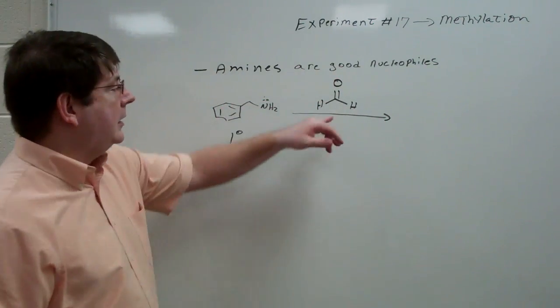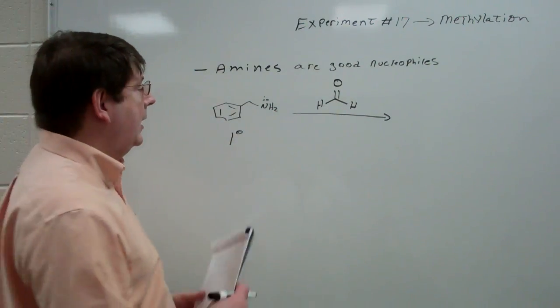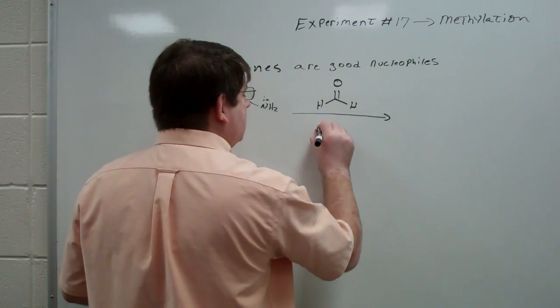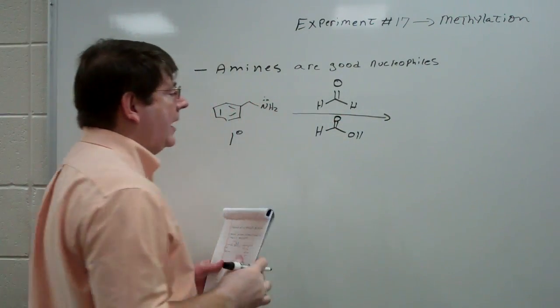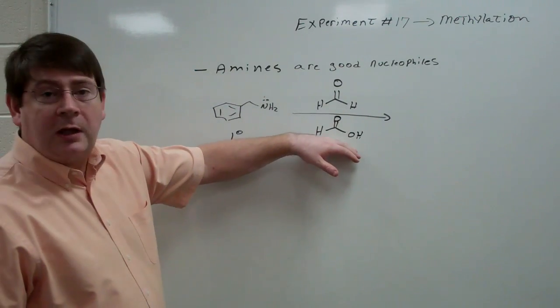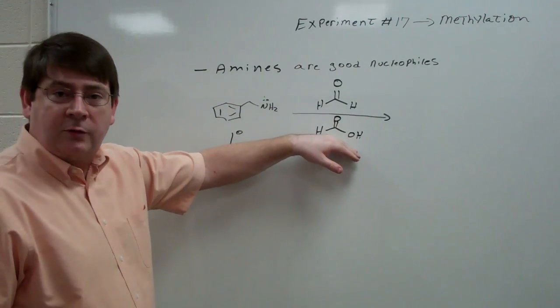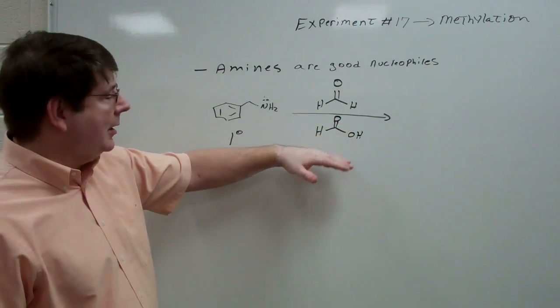This is the aldehyde that's used in biology to preserve specimens and things like that, and formic acid. And formic acid is the acid that you get when a fire ant bites you, for example. So it's the stinging acid, so don't get this in your eyes, it will sting.